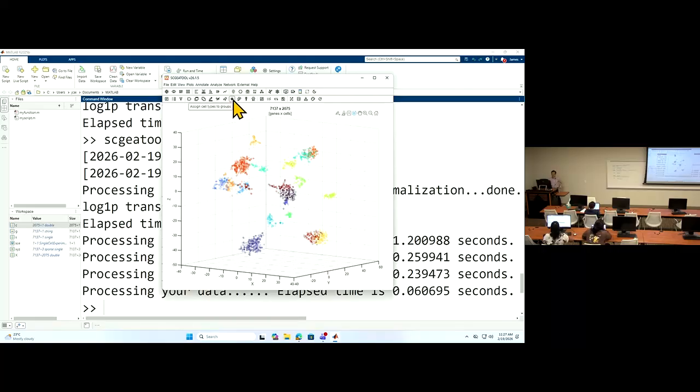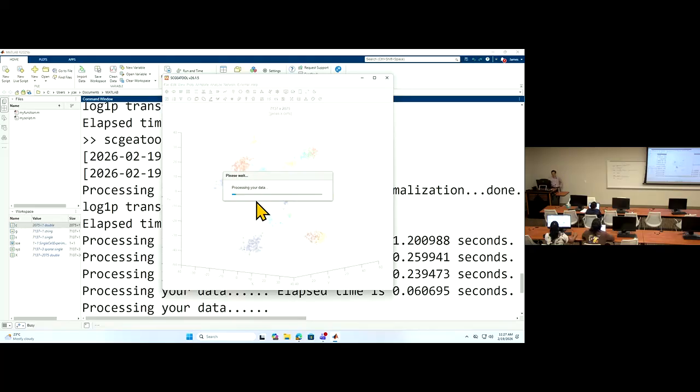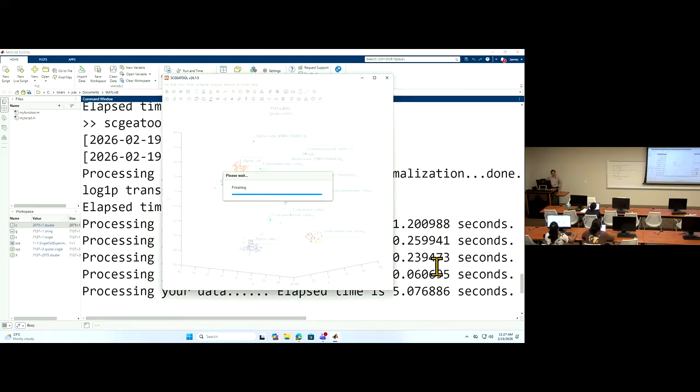So after you cluster, you click this button here, and this will search a database using marker genes to assign each cluster a name. So we will select the species, and the top one you assign automatically. So you know how to do it manually, select this, but now we just automatically do all the 20 clusters altogether. So this procedure will go and pick the top one and assign the cell type. Then you have to merge.